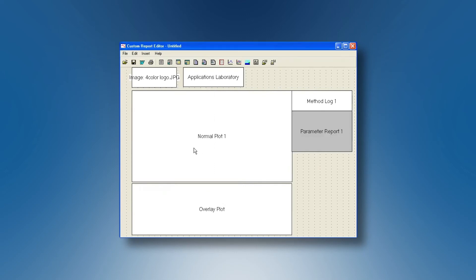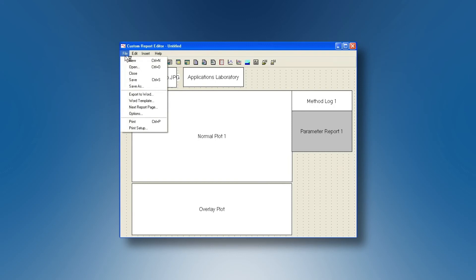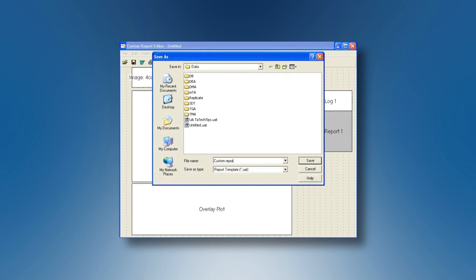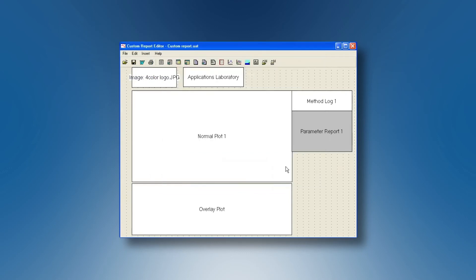When this is done this custom report presentation can be saved so you do not have to do it again the next time and you will go to file save or save as and you will give it a name. It will be ready for the next operations.